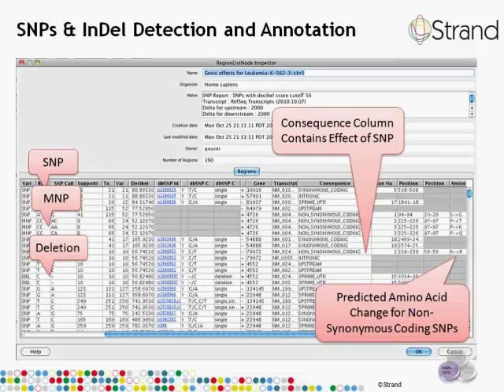The calculation of the score is a complex algorithm, but takes into account things such as the number of reads supporting the SNP versus the reference, the quality score for the base call at this position in each read, and the mapping quality of the read, and a number of such other criteria. The SNP is also a known SNP since it's annotated with the dbSNP database identifier.